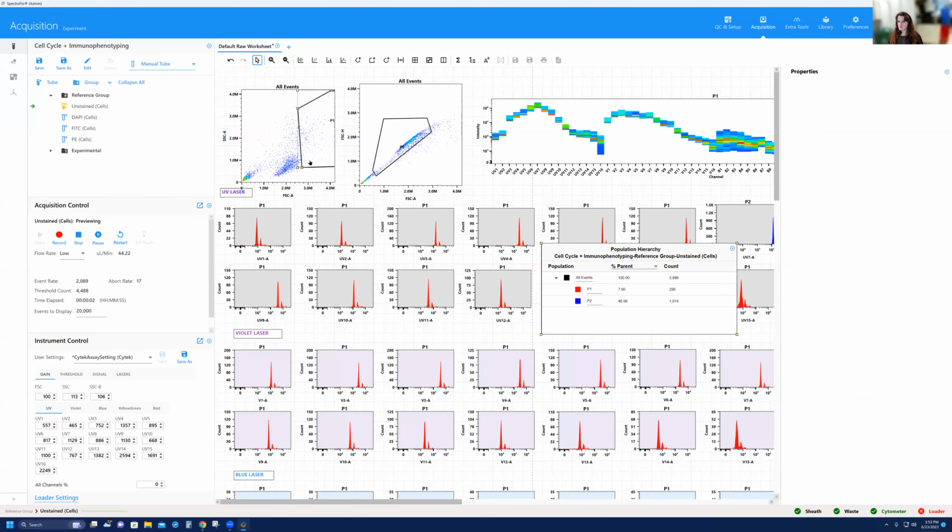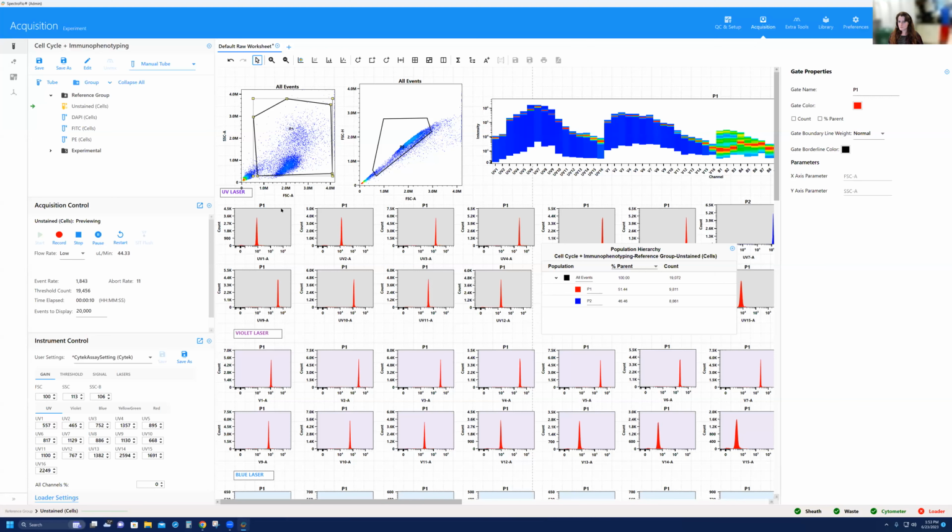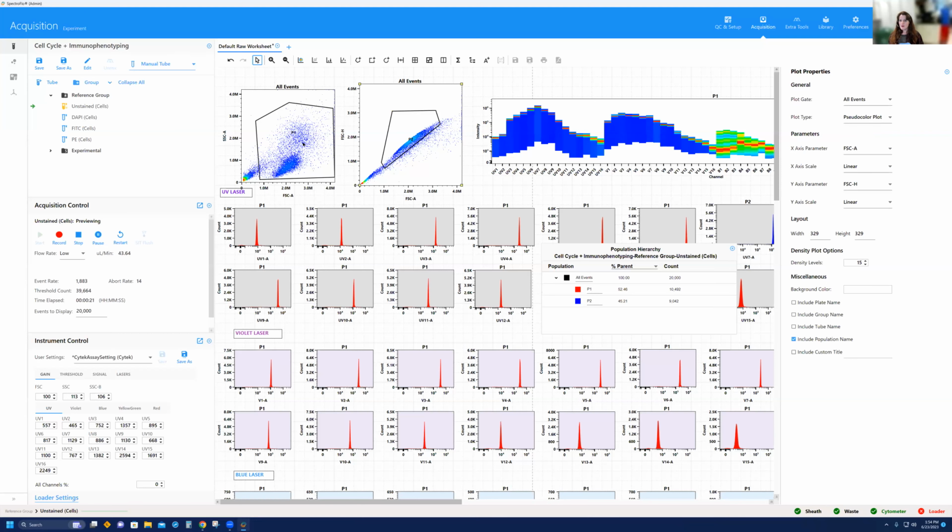When I do that, you see now I only have 7% off scale, but that's including some of these. If I bring this up and over, what do I now see? I see I have roughly 52%, and this gate can be cleaned up. It can be prettified. I don't know, that's not a word at all. I just made it up for this session, but I can update this gate, and I will.